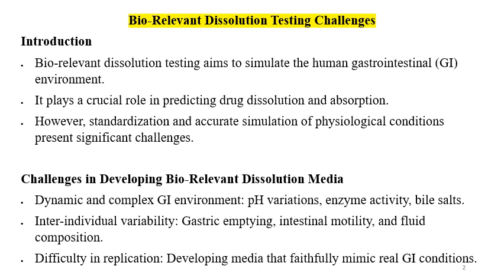Inter-individual variability will be there in gastric emptying, intestinal motility, fluid composition, disease conditions. Many things will pose challenges. Difficulty in replication: developing media that faithfully mimic real GI conditions.